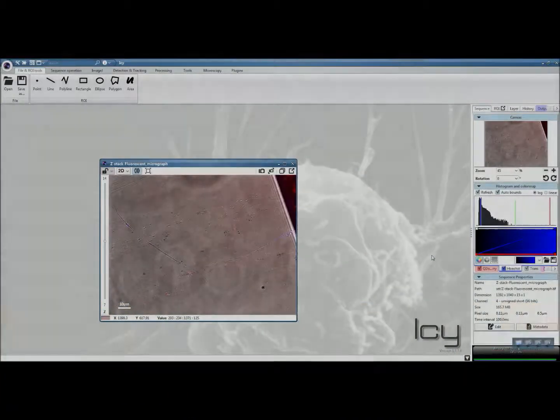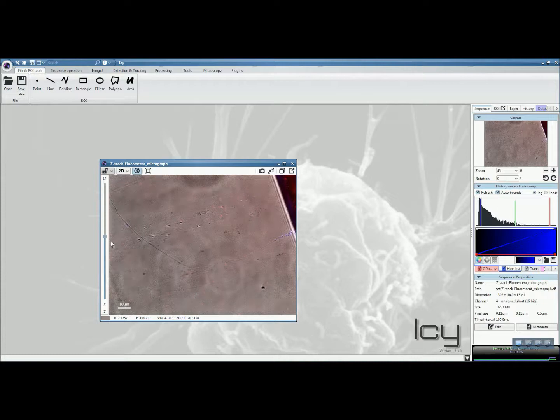Hi, assuming you have a 3D fluorescent stack containing your fluorescent signal spanning over 7 microns here with a scale bar, assuming that we have a step of 0.5 microns, and you want to project the fluorescence of this section onto a 2D electron micrograph, you will need to flatten your image.